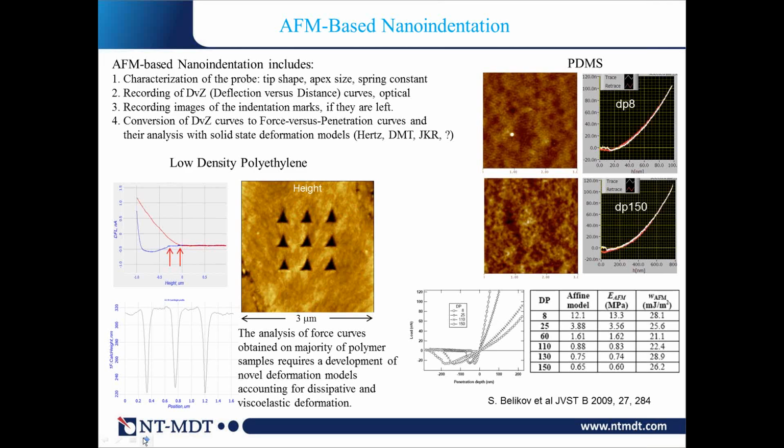So far there is nothing better than nanoindentation. You can understand nanoindentation not necessarily as a process where you only make holes. In many cases, you deform elastically and then the material recovers. It's also an indentation, but one that doesn't leave marks.